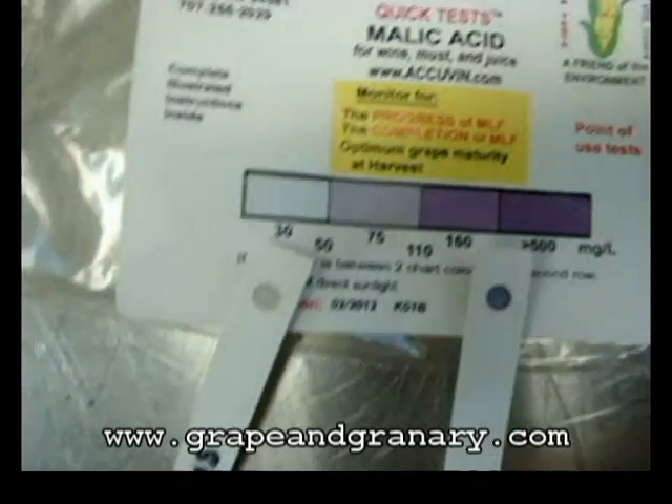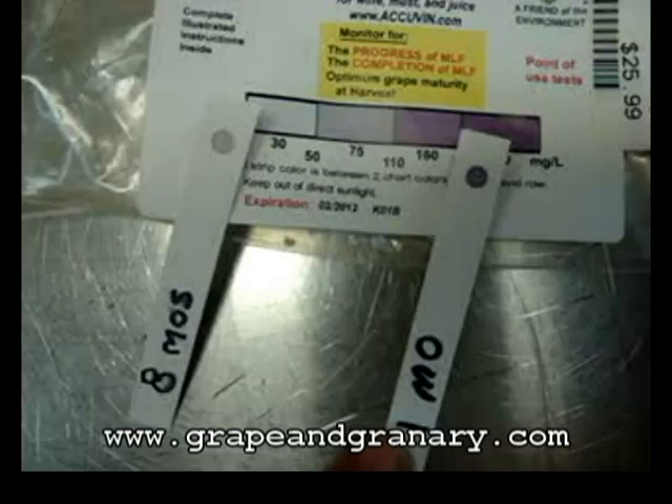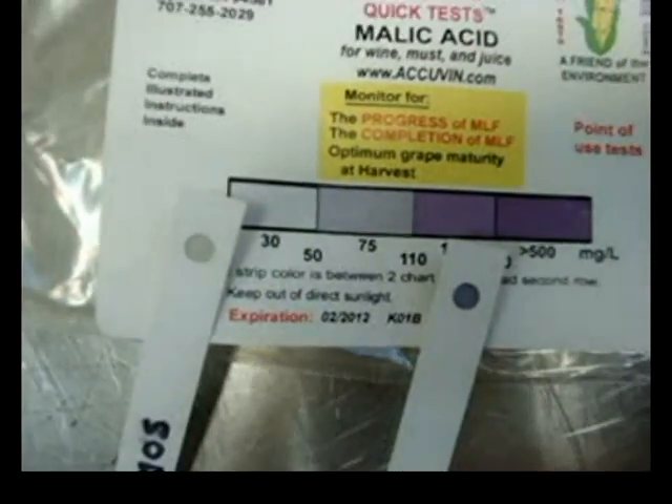Sample number one — the eight-month sample — has undergone malic lactic fermentation successfully, and our second sample with one month of MLF has more malic acid left to be converted.